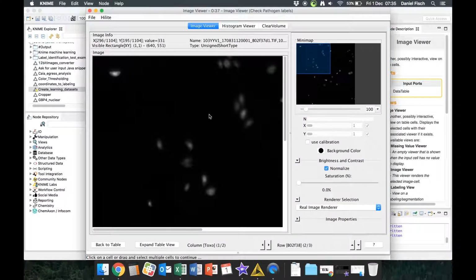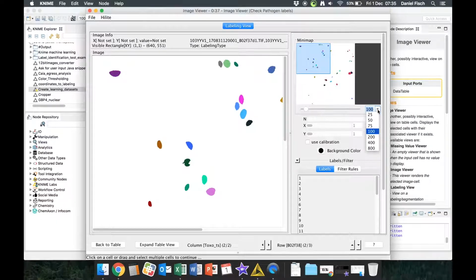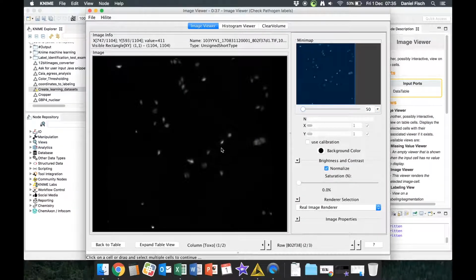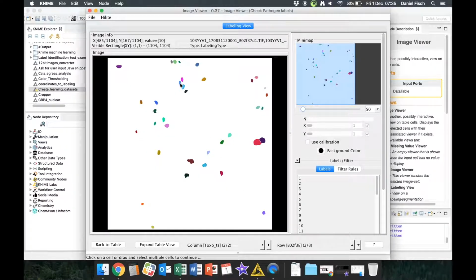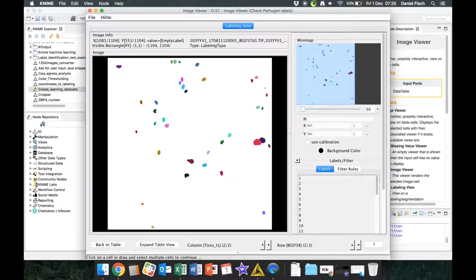Again, here these are our pathogens that we imaged, and if we then look at the segmentation and set this to the same zoom, you can see that it did a pretty good job segmenting all of the vacuoles. You can see here the 4 individual ones are segmented individually. Here the 2 big vacuoles that almost touch each other were still segmented as individual objects.